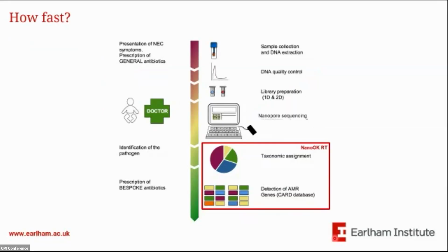So we put this all together. This was the pipeline you saw at the start, and we can now put some times in here. So we receive the fecal samples at hour 0. We're sequencing within about 3 hours, and then we sort of argue in the paper that within about 4 hours there's potentially enough information to prescribe bespoke antibiotics rather than broad spectrum ones. And that, as I say, compares to maybe 2 or 3 days for a conventional process.